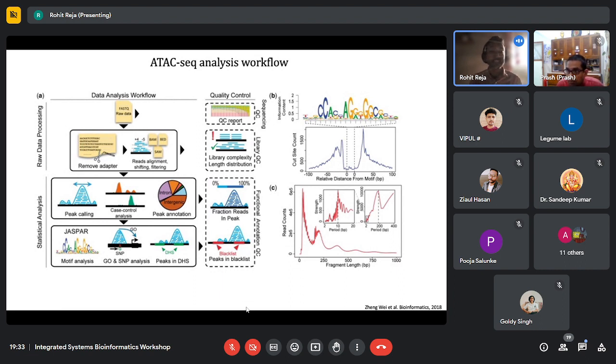Now, if there is an ATAC-seq peak in a non-coding region, and you see there is a SNP that is associated, and you can associate that ATAC-seq peak to the nearest gene or to whatever gene, then you can now have some functional link to these SNPs that you could never associate before. So that's the powerful approach that's currently being used to associate these non-coding peaks to some sort of biology.